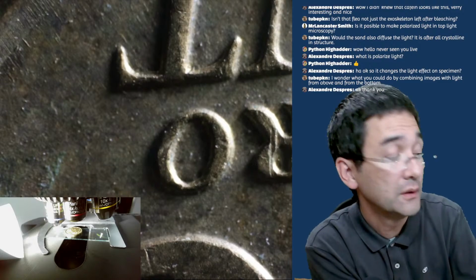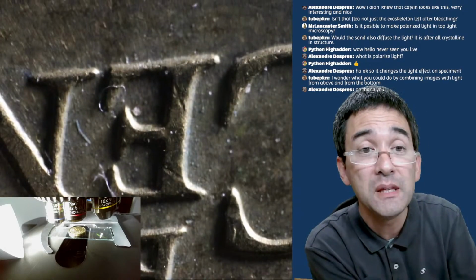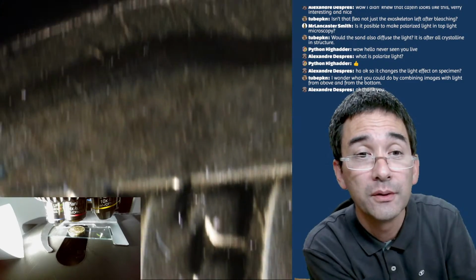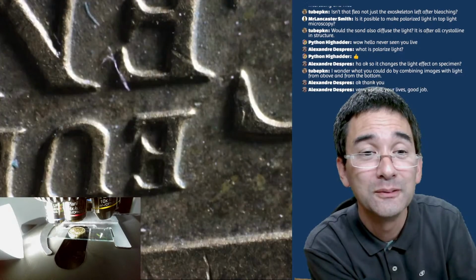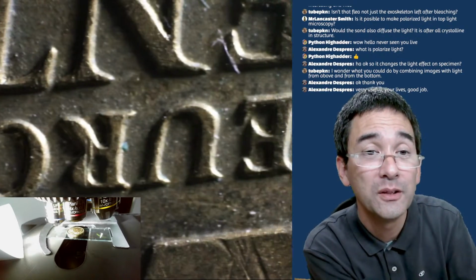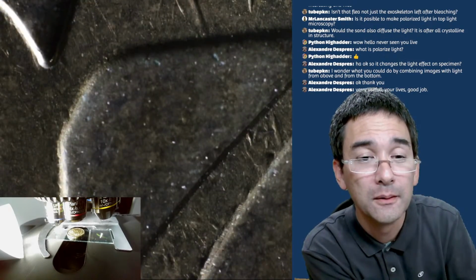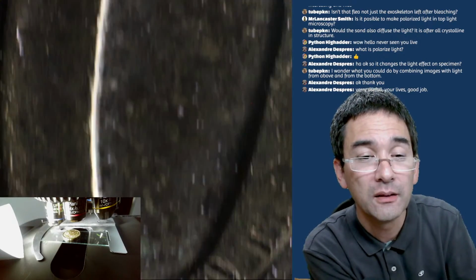And you see all of the scratches. Coins, or money, are always good specimens because they're reflective, and you can therefore see it quite well. Quite a lot of scratches on the coin here. It's a 20 euro cent coin. So it's copper. I think you get the idea here.